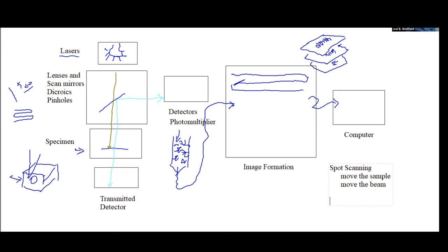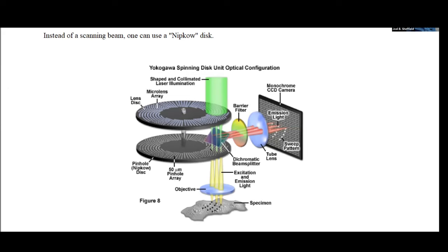used what is called a scanning disc, a Nipkow disc. Well, Nipkow invented this thing in 1885, and certainly it was not considered to be very useful for microscopy at that point. The idea of a Nipkow disc, and this one is the disc itself, okay, is that it's a disc, let me simplify the disc now. That has a series of holes in it. And the holes basically track, if I could do this right, a spiral, a single spiral like this.